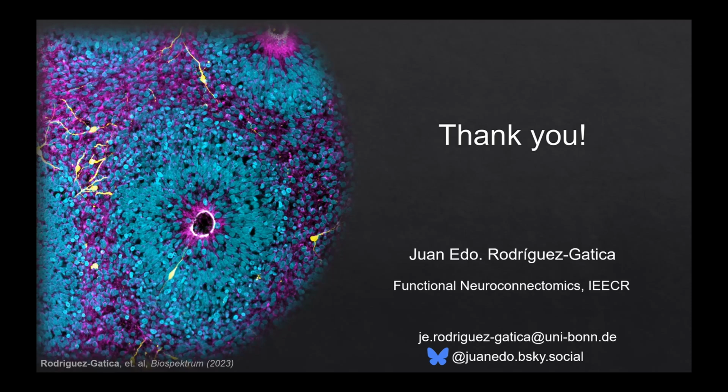You can also in the future use fiducial markers, or you can add some beads, for example, outside your sample embedded in the gel, and then try to find that in the light sheet data. And usually, if your expansion is working properly, a rigid transformation should be good enough to put the volume of the confocal and the light sheet in place, right? And then you can measure.